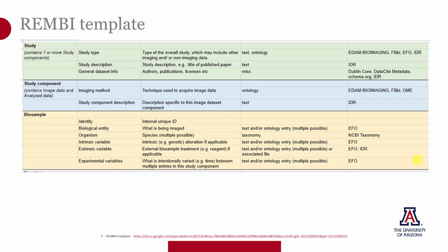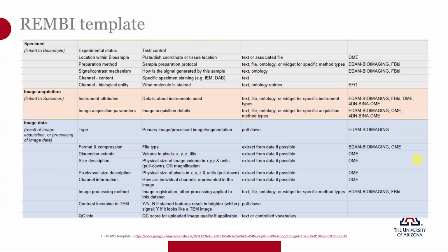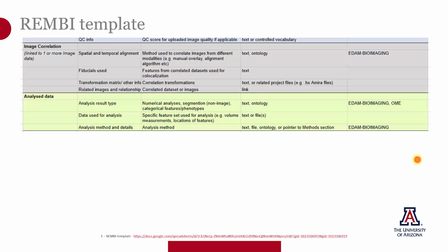We have study component, the sample, more about the specimen that was collected, the image acquisition, the image data, how it correlates, how it was analyzed. It's just quite a bit here.